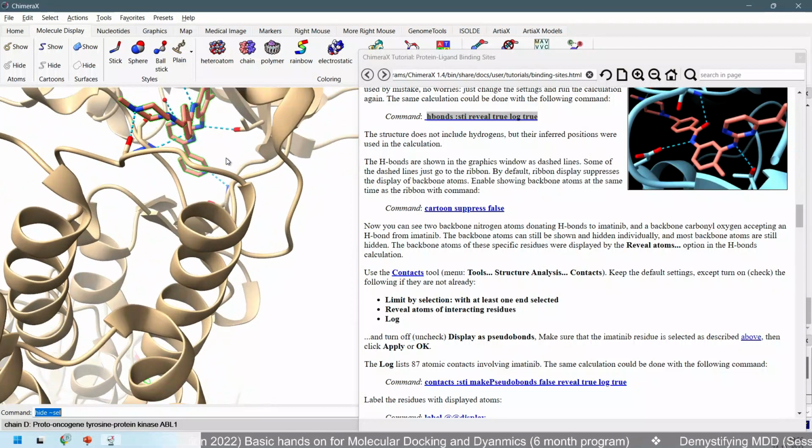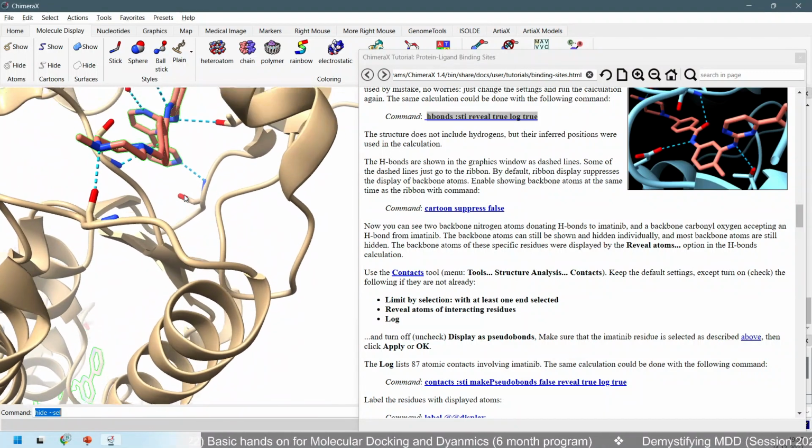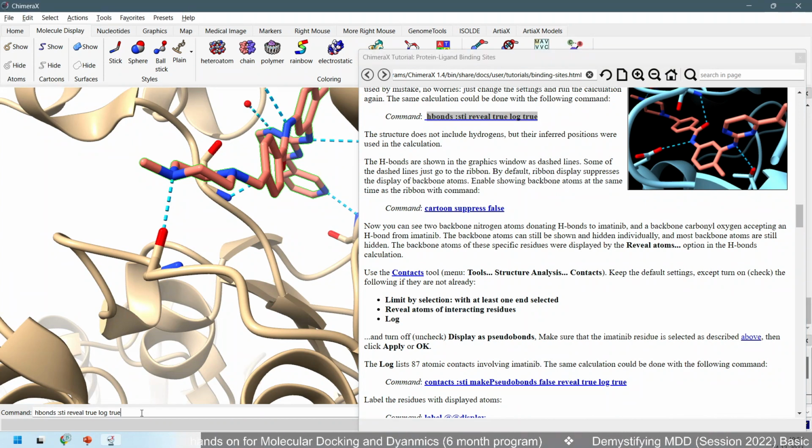And earlier if we add the show distance command, it will show all the distances. I will repeat this command by copying and pasting to show the distances, with show this true. Actually you need not type the complete keyword, but it is recommended to type it.